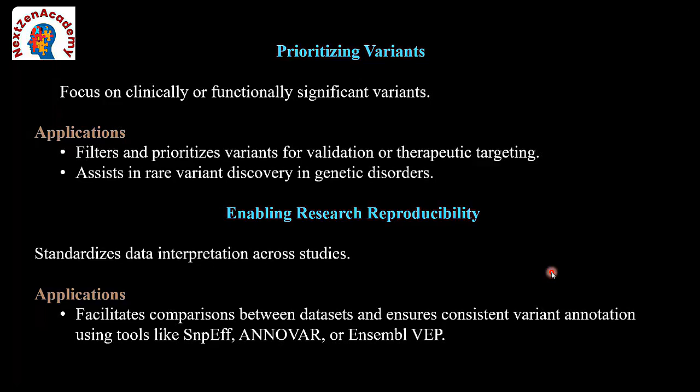If you are working on an oncology-based study, genes like BRCA1 or BRCA2, which you know as breast cancer genes, get the highest priority. That is helpful if the tumor is getting suppressed, when the specific gene is suppressed. We need to give proper functionality to a particular set of genes to study targeted therapy, depending on what kind of study we are working on.